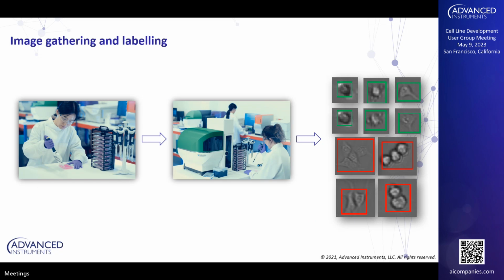All right. The first piece is the data prep, which is where all the heavy lifting is involved with the wet and the dry labs out in Wimborne. We have our scientists meticulously pipetting out the cells, and ideally, we try to capture as many images and as much data as possible. There are a lot of different permutations that can exist when we're seeding out these cells. Obviously, it would be nice if all of the wells that we pipetted out were clonal. That would be ideal, but I think everyone knows that's not necessarily the case here.